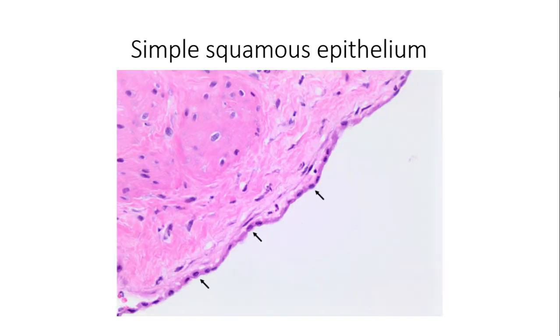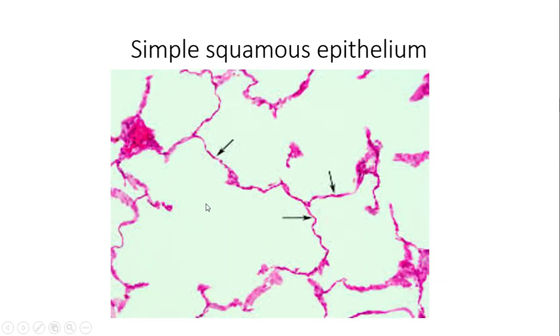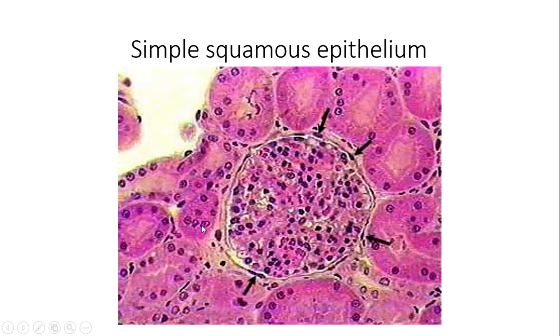Alright, so first I'm just going to cover the epithelial tissues. When we're looking at the epithelial tissues, we're going to start off with the simple ones, right? So we're going to do simple squamous epithelium first. And what you notice with the epithelial tissues is you're always going to have this free space, the free surface, because these epithelial tissues line body cavities, okay?